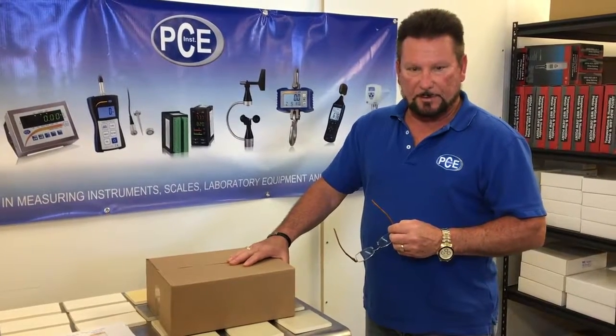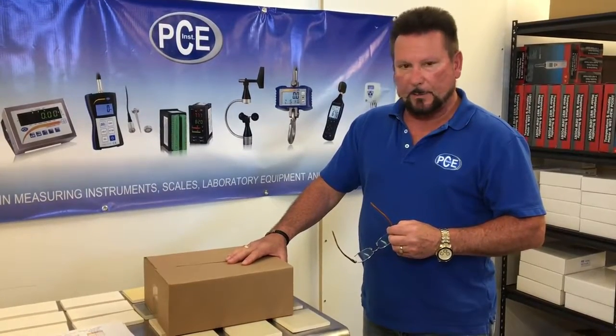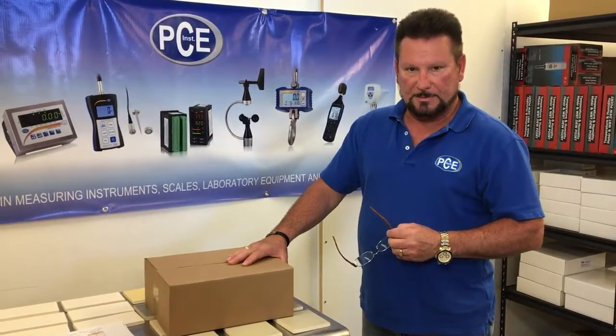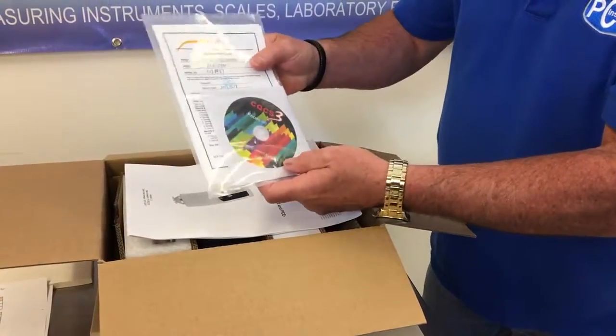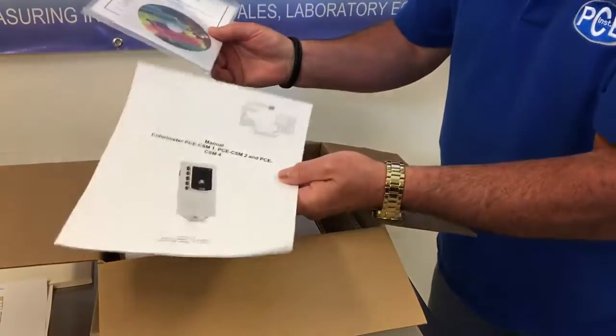Hello, my name is Donald from PCE Americas and today I'm going to be demonstrating the color meter, the PCE CSM1. This is the color meter and this is the way it comes in a box with the software and a user's manual.